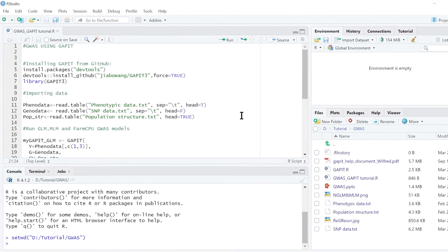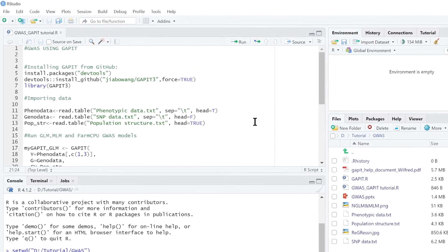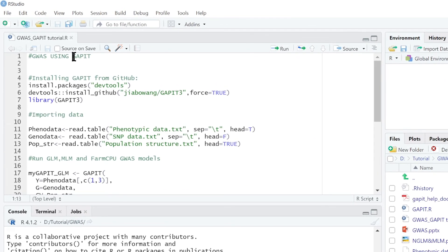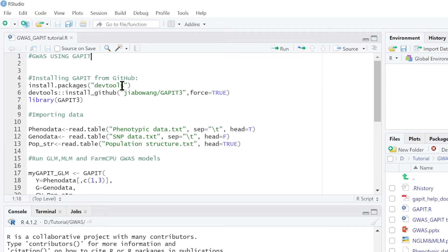Now I want to show you how to do GWAS analysis using R. We are going to use a package called GAPIT, which stands for Genomic Association and Prediction Integrated Tool. We can install GAPIT from GitHub using this command — first you install devtools, then install GAPIT using this code. I have already done that.